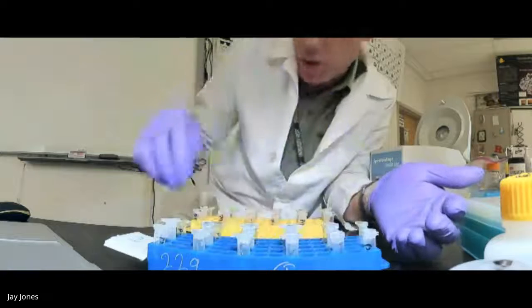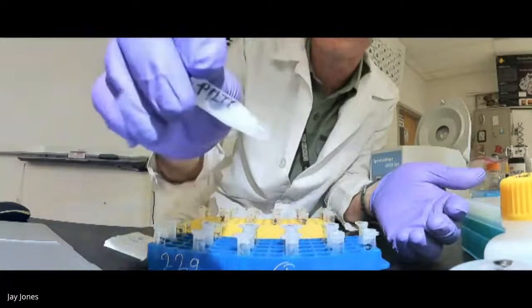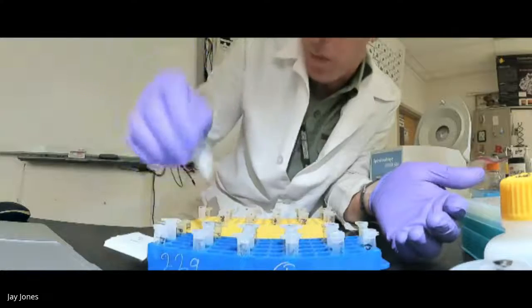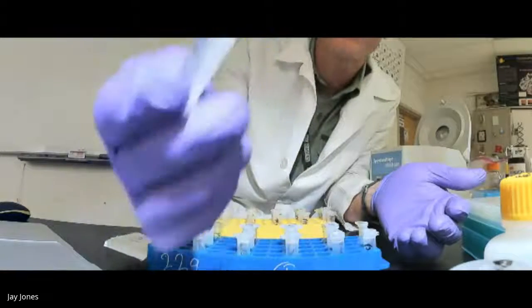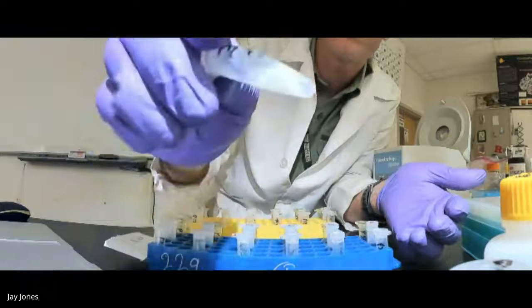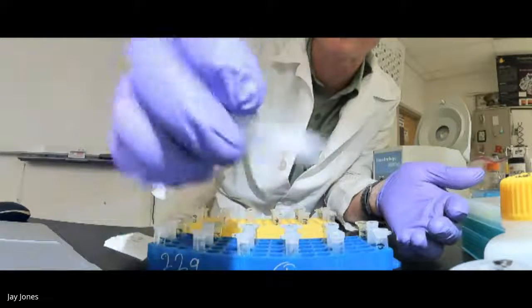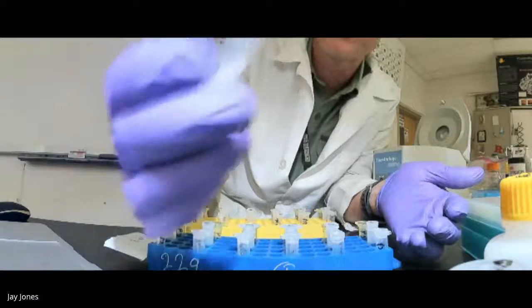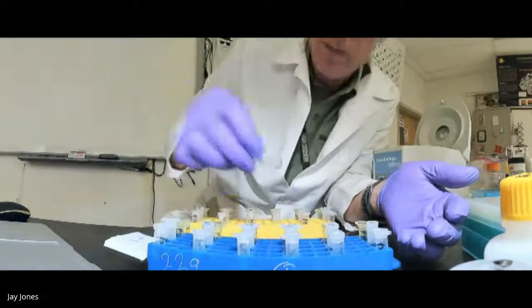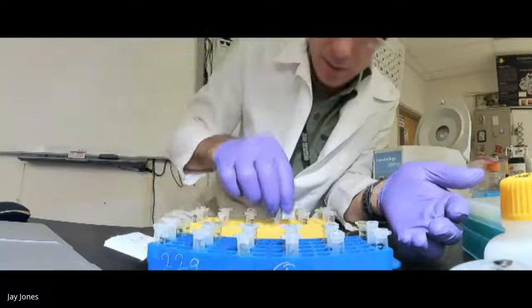But so we've disrupted the membranes. Everything has protons now. The soap doesn't work, and we're getting precipitated masses. Again, a soap is just a molecule with a charged end and a nonpolar end. That's the bell. We're going to keep going. Give you a break in a minute. We're going to put these in for the big spin, the 5-minute spin. Almost ready.